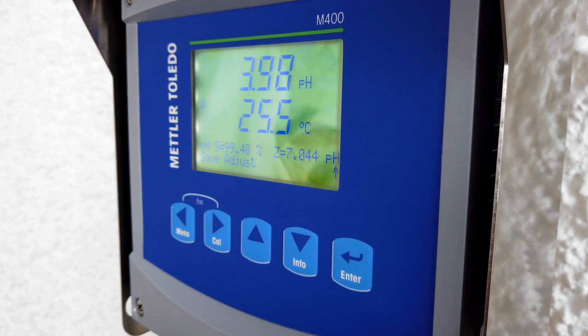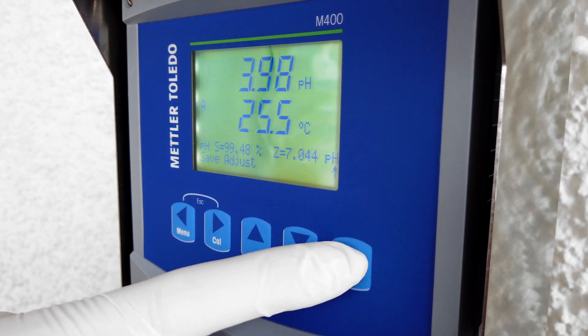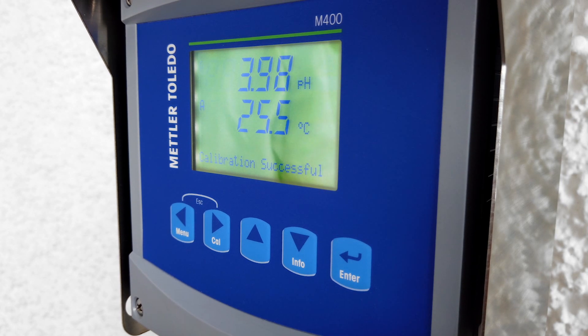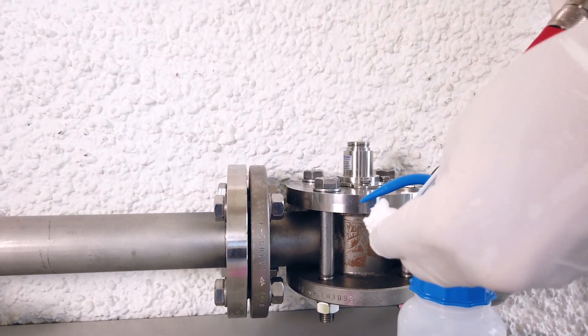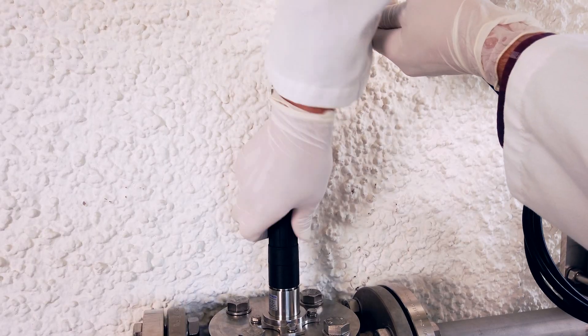Now you can see on the M400 transmitter that the sensor was calibrated, with the displayed slope in percentage value and a zero point in pH value. You can now adjust the sensor by clicking enter — this saves the calibration data and stores the values for the zero point and slope on the transmitter. Your sensor is now calibrated successfully.